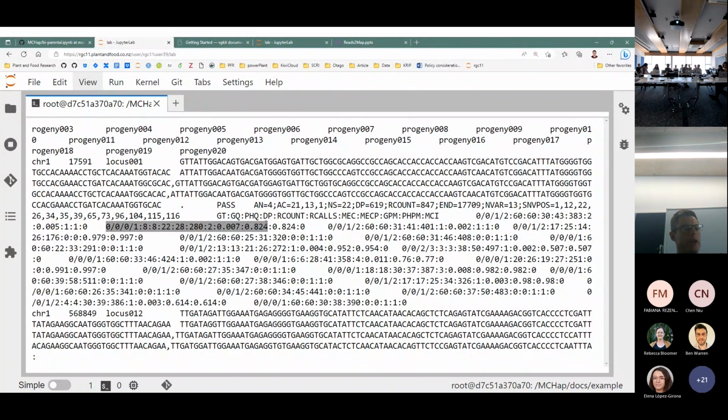In the past with this, I do a lot of QC around my samples looking correct, based on either the SNP calling data that I originally generate or the initial assembly results. So even though MC-Hap assemble produces less confident results that can be noisier, for kinship-based analysis, trying to identify outliers, it still can be fairly useful. So you do have the option of just using the MCHAP assemble results directly, but they will be noisier.